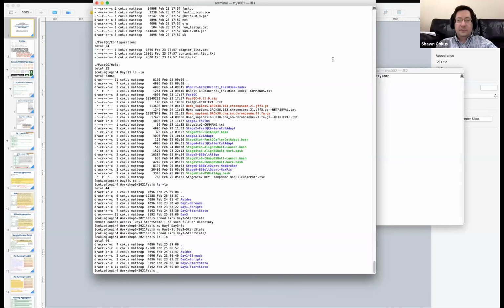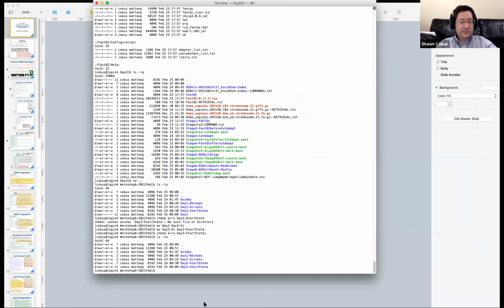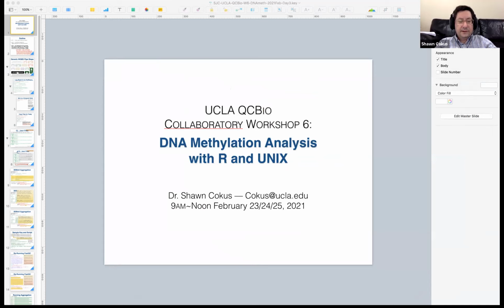All right, so we're slowly building up here to our usual situation. Chat window floating over here somewhere. Got terminal window going. Okay, let me start that fresh. Then I should restart screen sharing just to make sure that guy gets included.